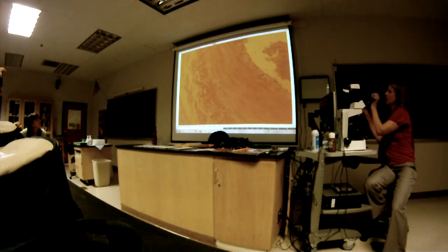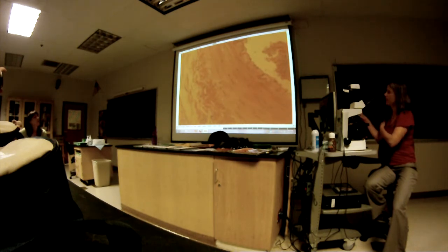Okay, so it's just very skinny. You're looking at simple squamous from the side. So you're just basically seeing the nuclei, the cells. It's one flat cell layer thick. Exactly. But then it also has what they call the elastic membrane in here. So this is tunica intima, all of this in here.